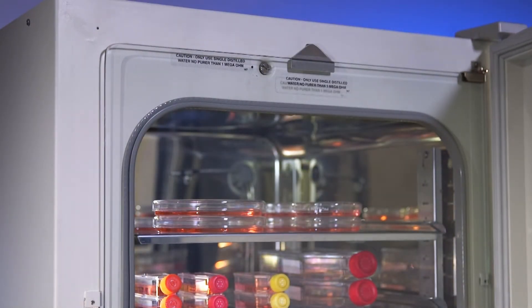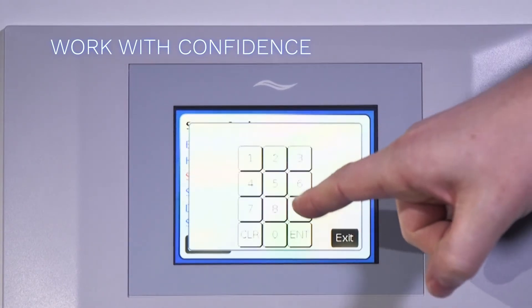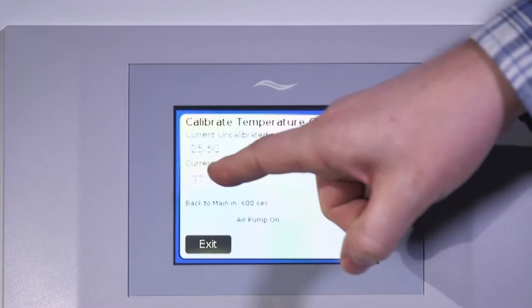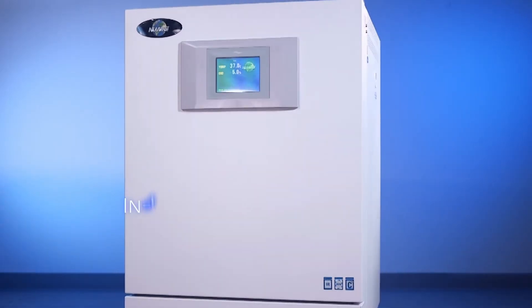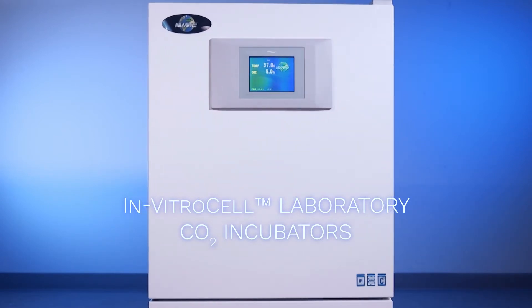On advanced models, you can also monitor RH and O2 levels. The new touch system makes using your incubator safer and more efficient, with maintenance reminders, alarm status menus, and more. The new touch electronic control system is just one more reason New Air is the safer choice for your laboratory.